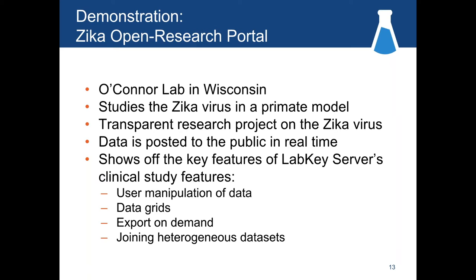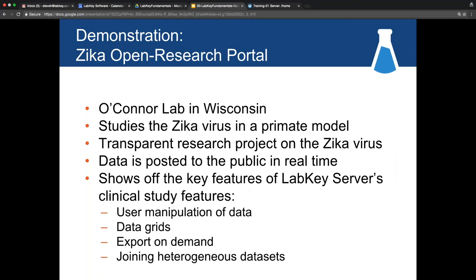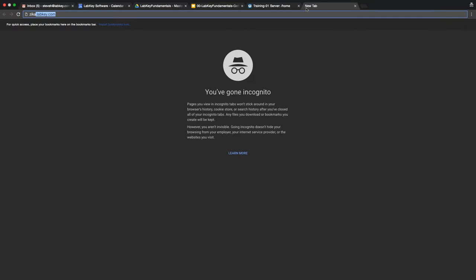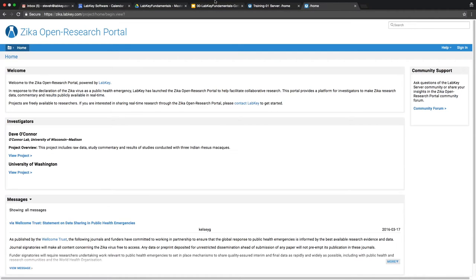As they bring in data from their different experiments on primates, they post it as fast as they can and it updates all their visualizations and reports in real time. Their portal shows some key features of the server — it allows user manipulation of the data. Even as a casual user approaching the Zika portal, you can create your own visualizations, filter and sort, and even join data in novel ways. You can also export data on demand if you want to work with it in your own tools. The URL is simply zika.labkey.com.